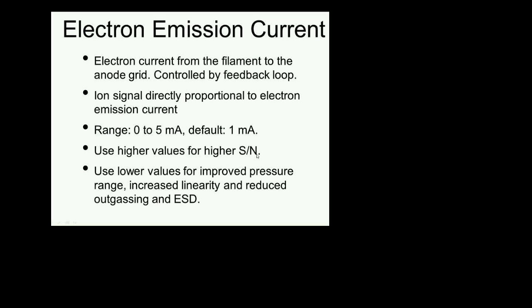So the emission current, most of the time I don't touch it. If I go to UHV, very often I will increase it if I'm trying to see if I'm missing something on the baseline. And I will reduce it if I want a little more linearity, in other words, more accurate readings at higher pressures with the same device.